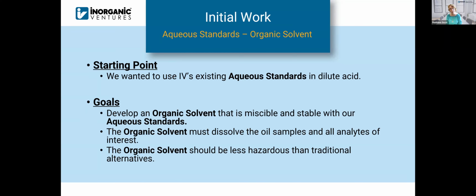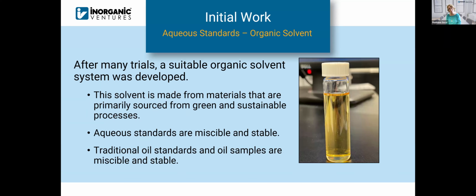When we were looking at the organic solvents that are currently and traditionally used for testing metals in oils, we saw they're quite hazardous. So we wanted to find a solvent system that would be better for the health of the analysts and also for our environment. After a lot of work, we did find a suitable solvent system. Happily, we did find that we could make this solvent primarily at this point from green and sustainable resources.